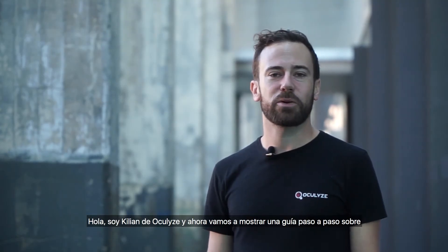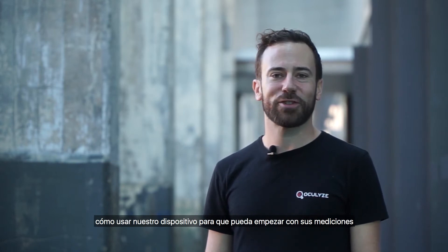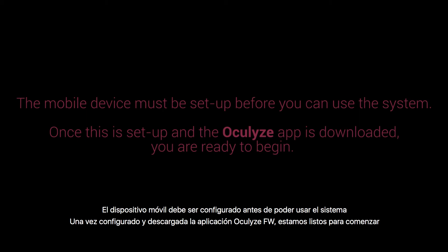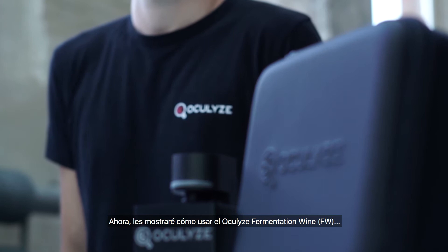Hi, I'm Kilian from Oculize. Now we're going to show you a step-by-step guide on how to use our device so you can get started with your measurements. I'll be showing you how to use the Oculize fermentation wine.